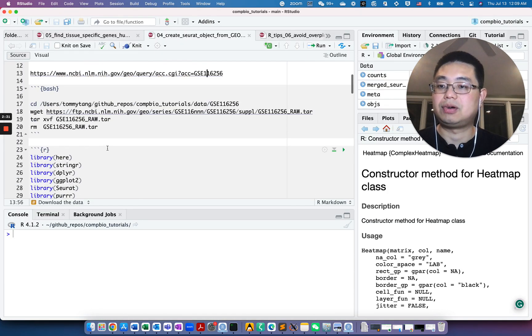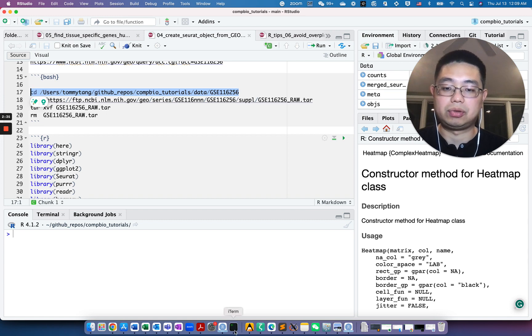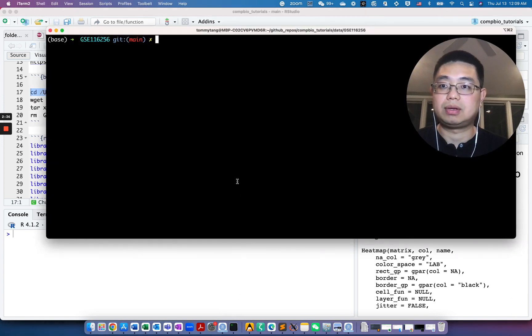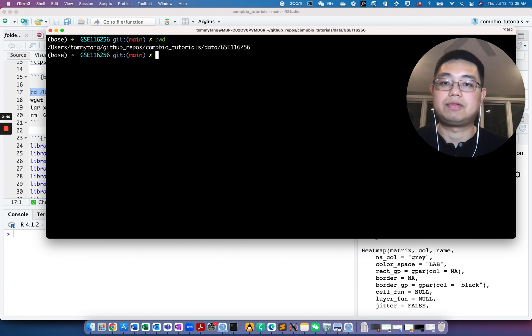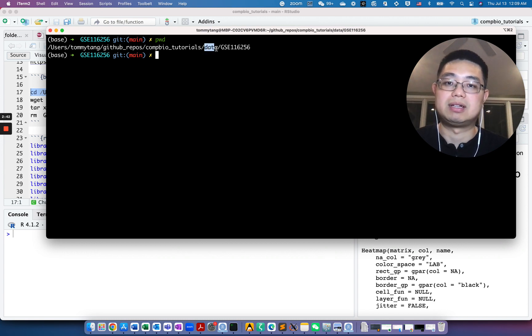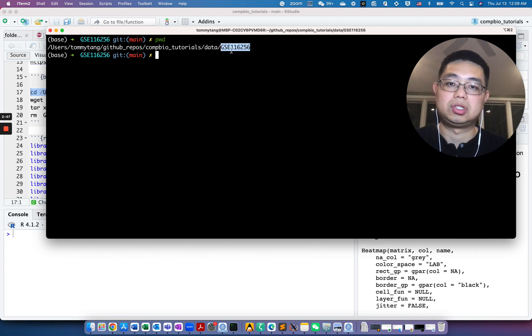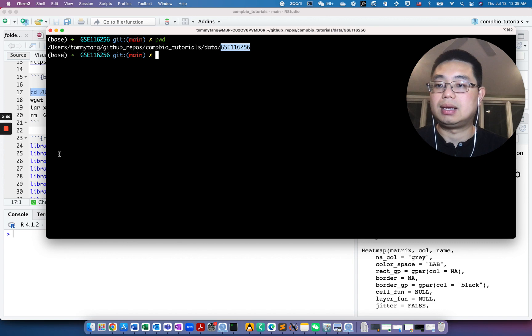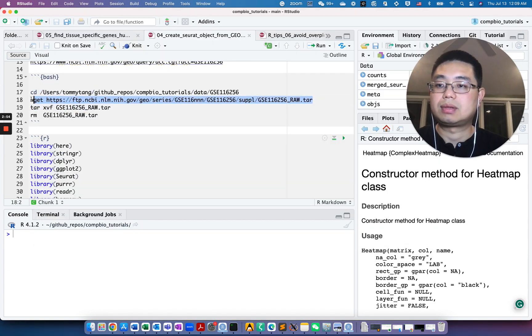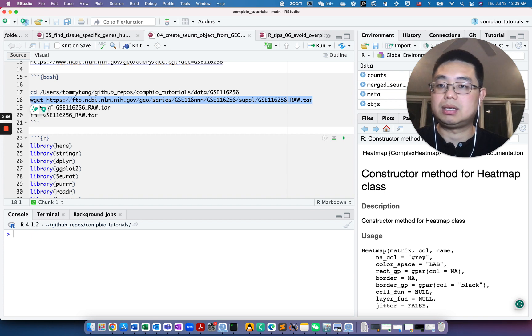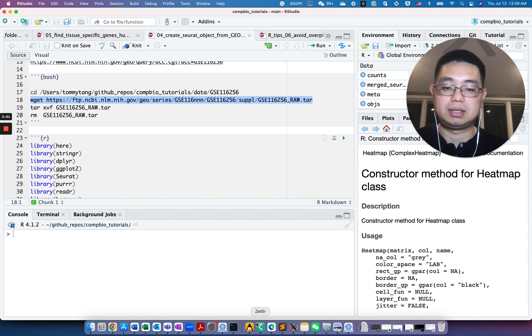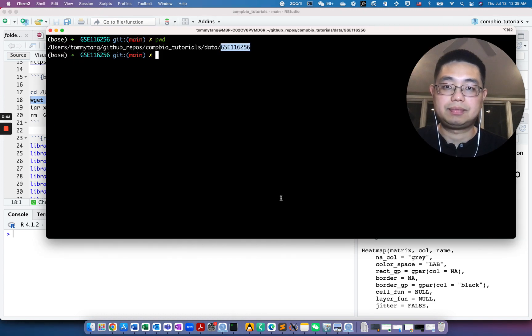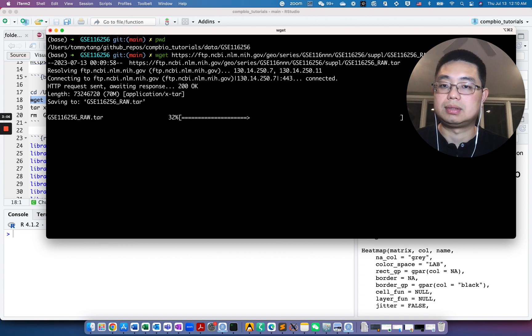Let's go to terminal and this is the folder. I have a data folder and I created a new folder just for this GEO ID. What I'm going to do, because I have that FTP address, I can use wget and download this tar file. It's a zip file. It takes a couple of seconds.